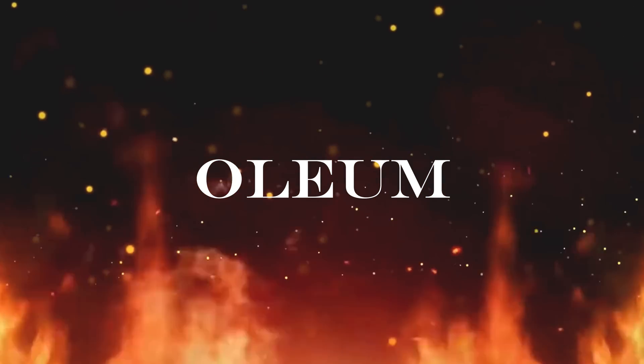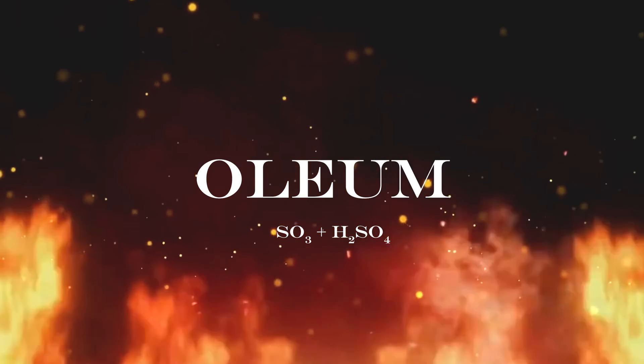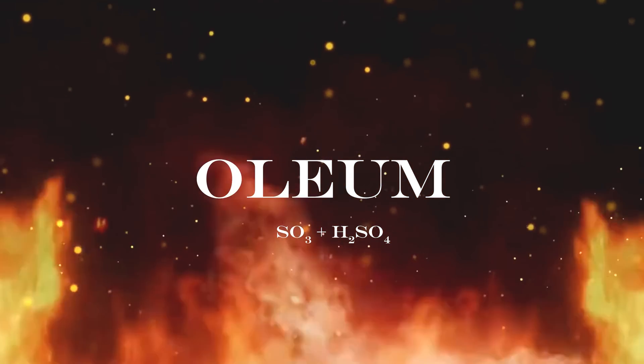Which is a solution of sulfur trioxide in concentrated sulfuric acid. Sulfur trioxide is annoying, and what I imagine the soil in hell to be made of.